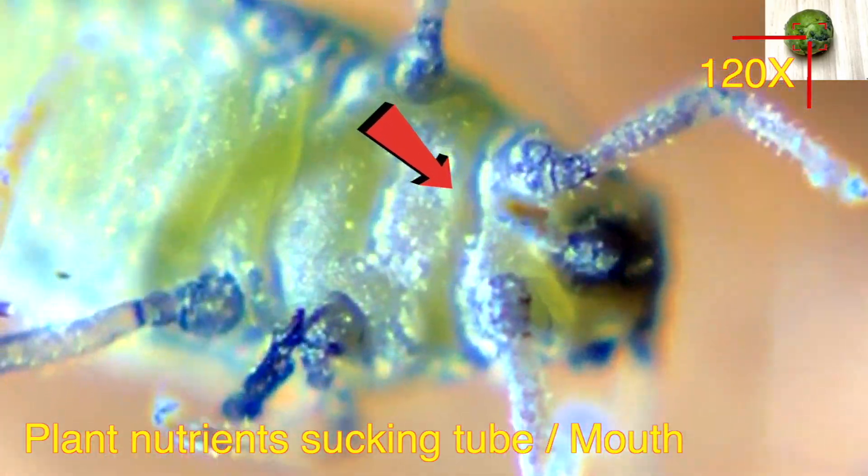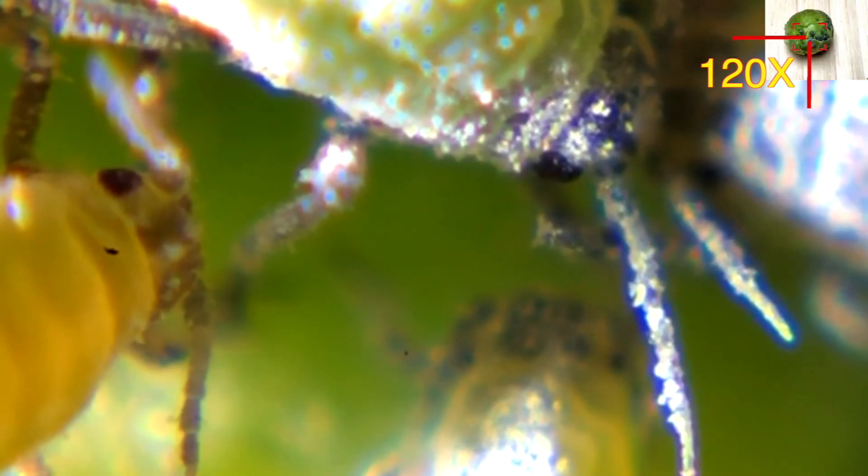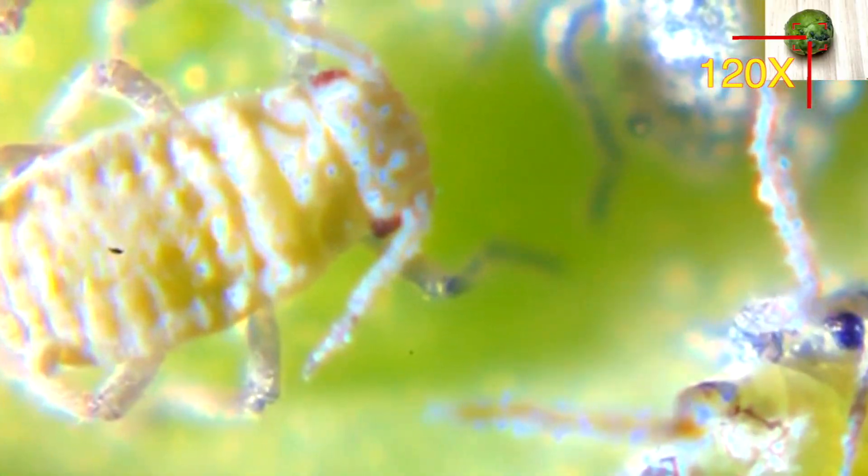Their eggs can live up to minus 42 degrees Celsius. These aphids have attacked my plants and they are useless now, so I just try to look at them under the microscope. They look like this.